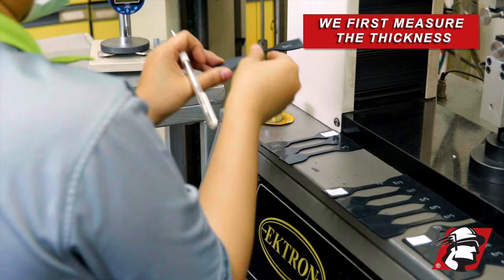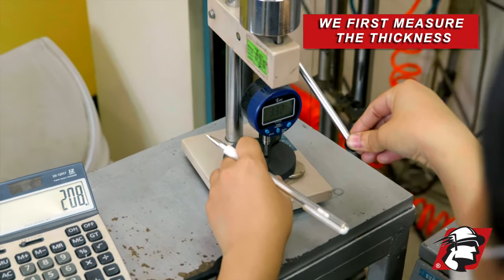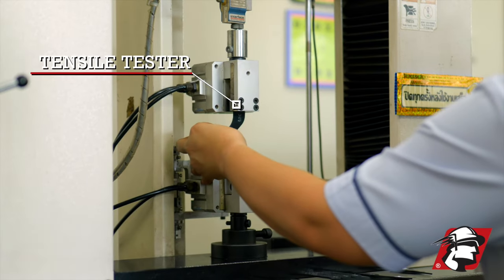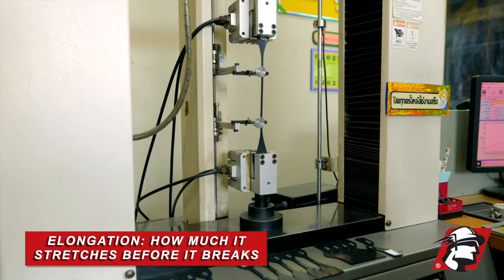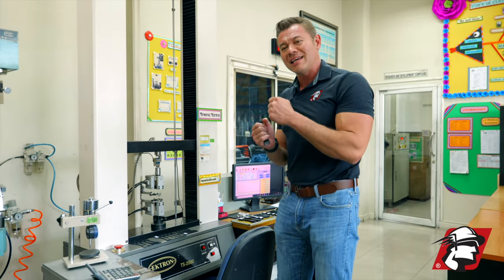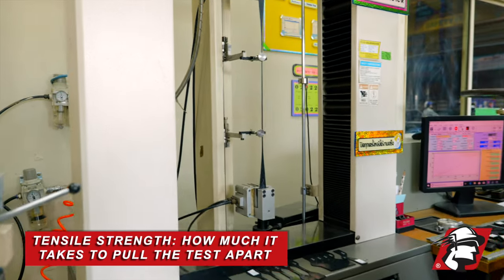First, we take one of these dog bone pieces and measure the thickness, record that data, and come up with the average thickness for all the test pieces. This is the tensile tester — when it pulls, it tests the elongation: how much it stretches before it actually breaks. While stretching, it's testing the tensile strength — the amount of force it takes to pull the dog bone apart.